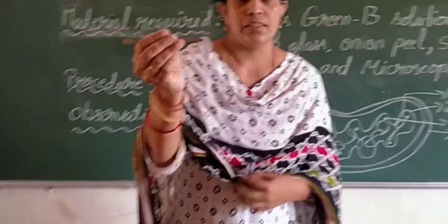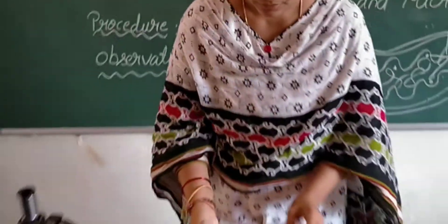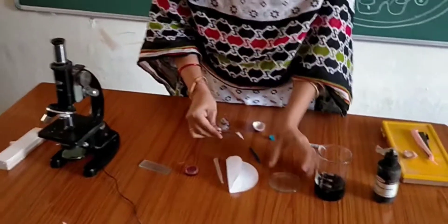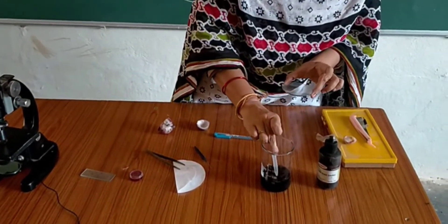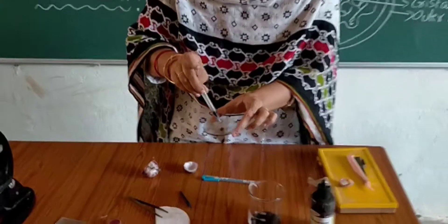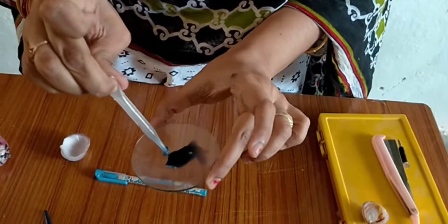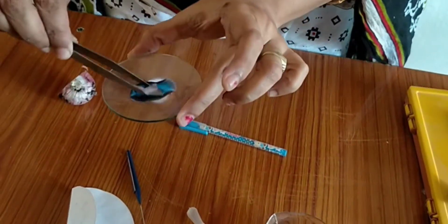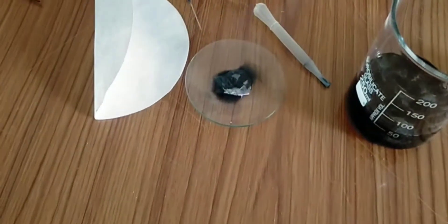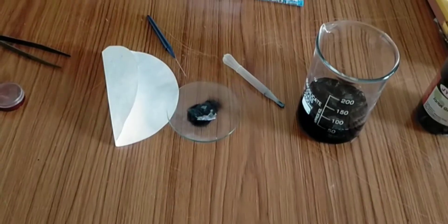We should take a thin layer from the onion. Then take this Janus Green B solution in a watch glass and keep this onion peel in the solution for about an hour. We should keep this setup aside for that time.